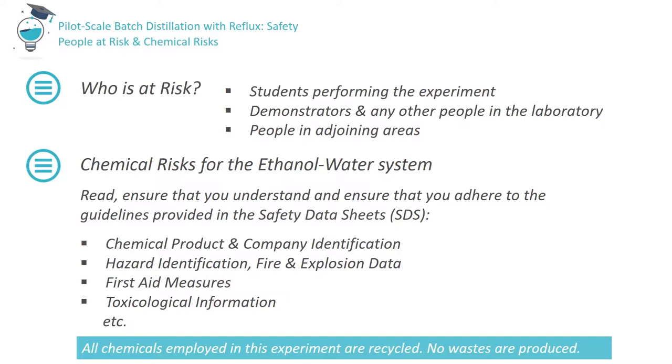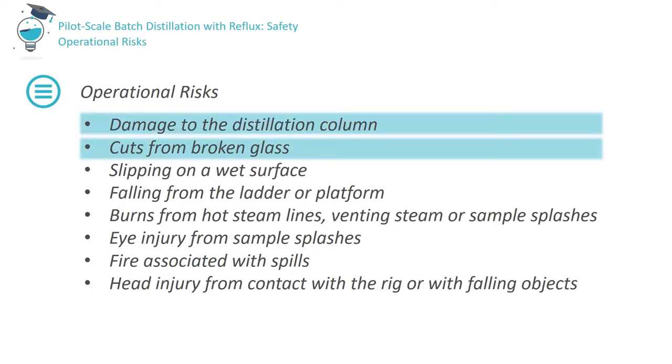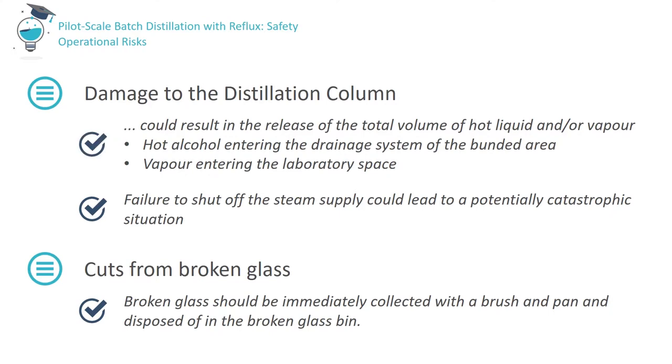No liquid waste is produced by this experiment since all chemicals are recycled for reuse. There are many operational risks associated with this experiment; these risks are greatest when those involved are unaware of the correct operating procedures and emergency responses. Amongst the most dangerous occurrences would be damage to the distillation column caused, for example, by mechanical stress or contact with a falling object. This could result in the release of the total volume of hot liquid and/or vapour. Failure to shut off the steam supply at the end of the experiment could also lead to a potentially catastrophic situation.